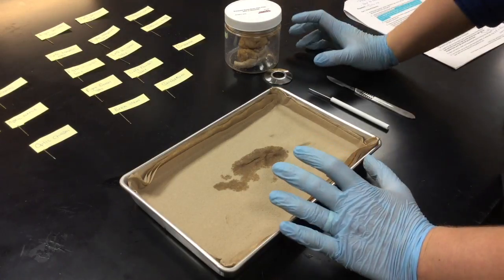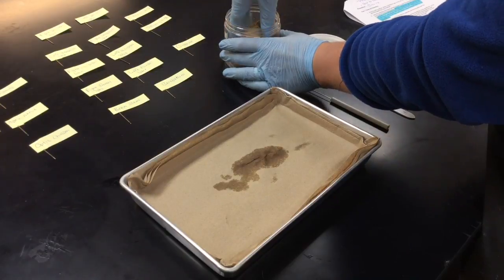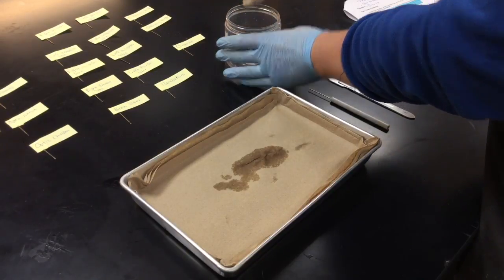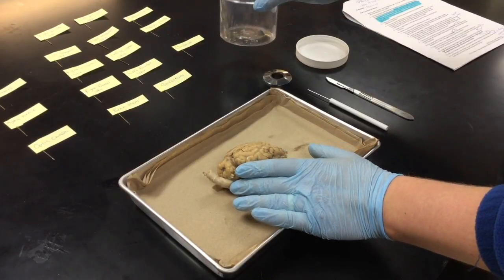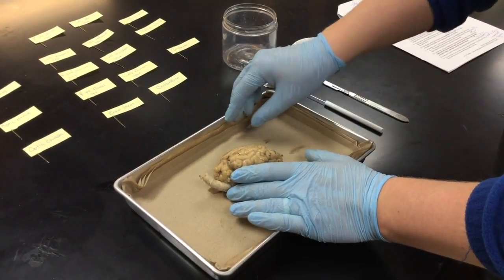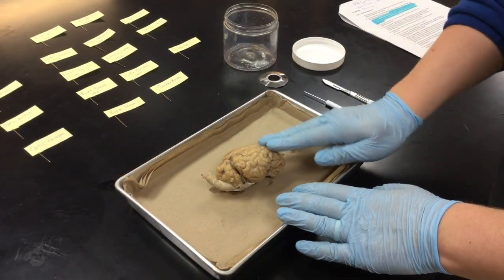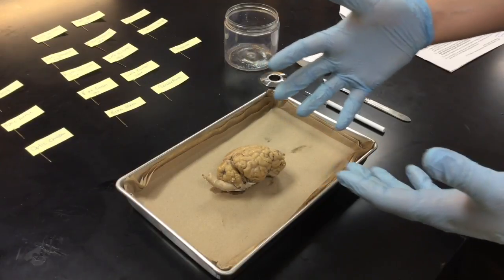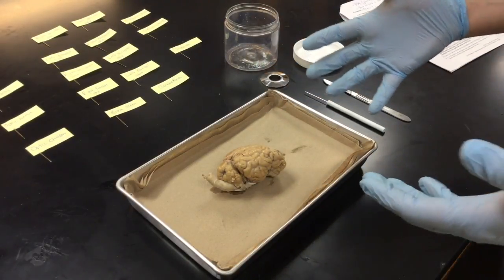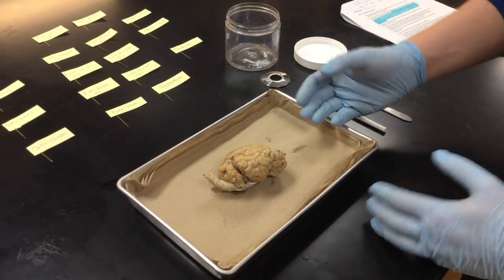All right, so we're going to get started with our brain dissection. The first thing that you're going to do is take your brain out of the dissection jar, and you want to place it into your tray. Now, there's going to be a lot of juice left over in your dissection jar, so take a little paper towel and lightly dry off your brain, so you're able to see what you're working with. Now, make sure you have your PPE on during this whole time to prevent your hands becoming contaminated with chemicals.